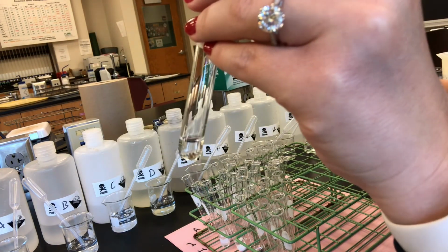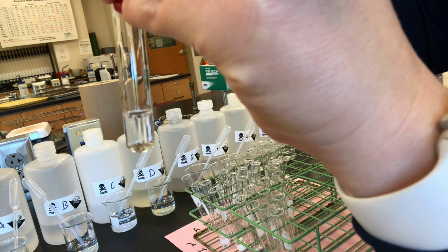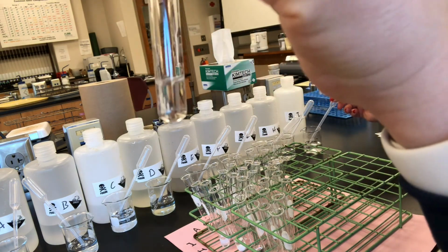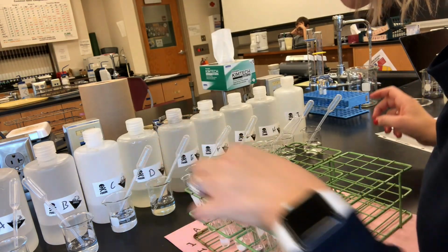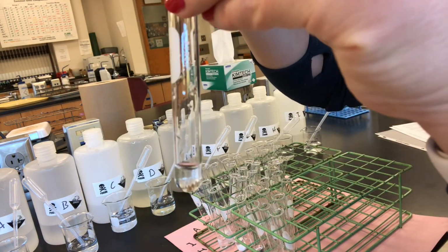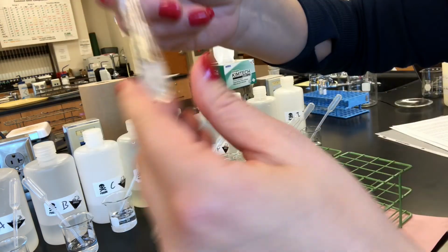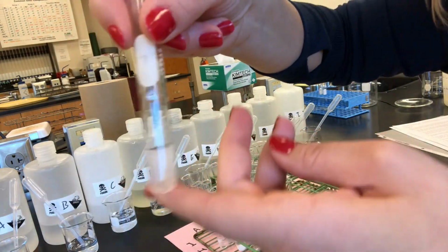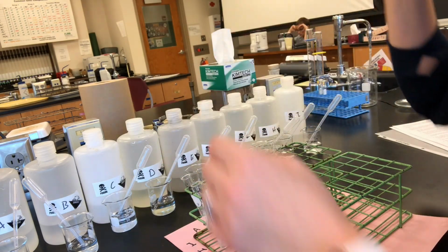We got B, again, clear and colorless. I'm going to take B, and I'm going to add I to it. This is B and I. No change. Now we're going to do B and H. B and H. Got action. Got ourselves a white fluffy precipitate formed. So B and H formed a precipitate.